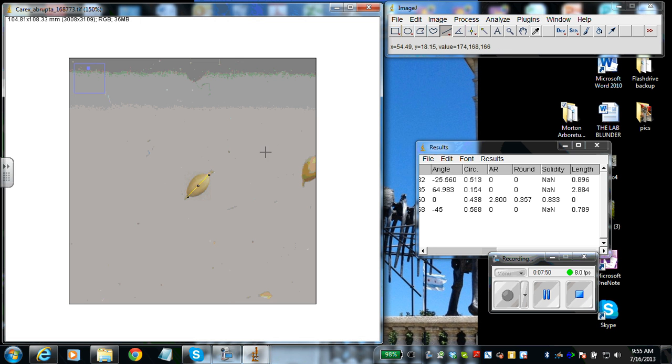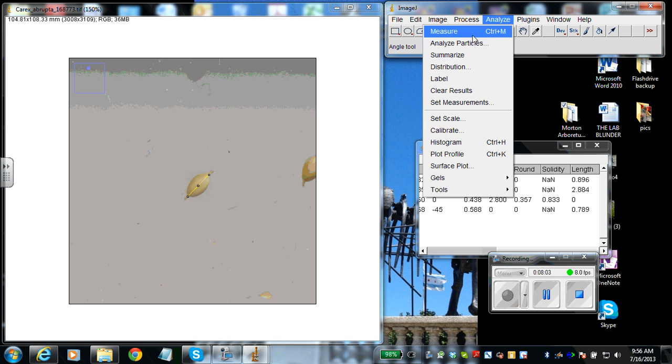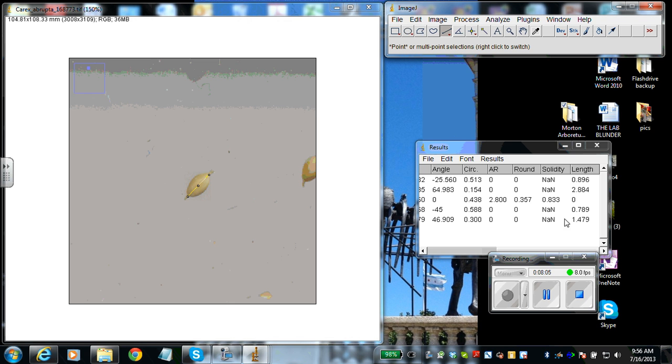And that's just because sometimes when the achenes are popped out of the perigynia, these pieces break off, right? So we're going to consider them a control piece if we don't use them in the data process. We'll analyze and measure that, and we get our length of our achene. So now we've done widths and lengths and areas of our different seed components.